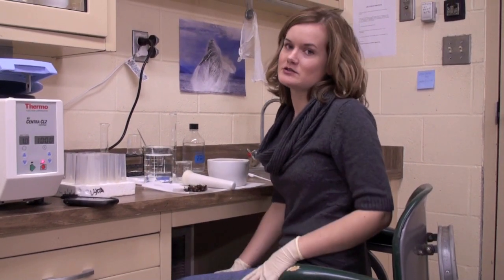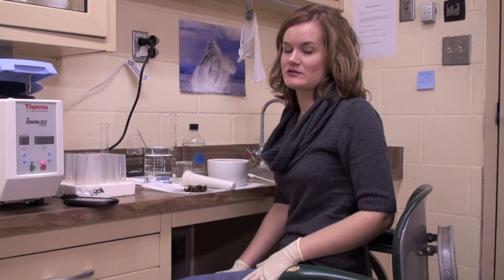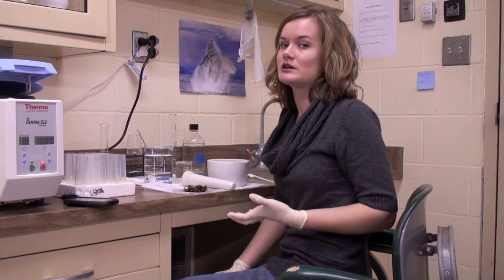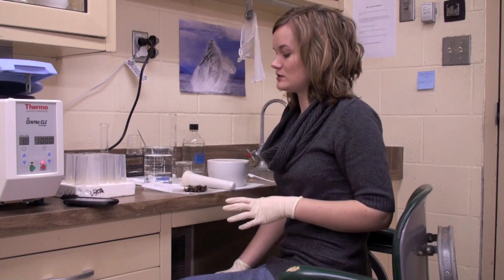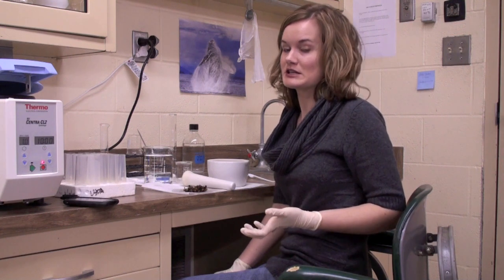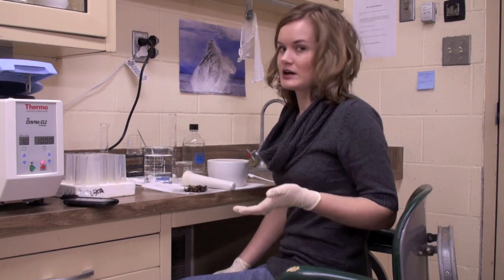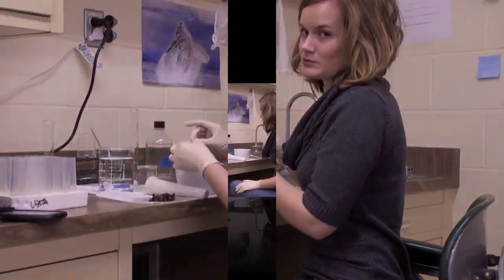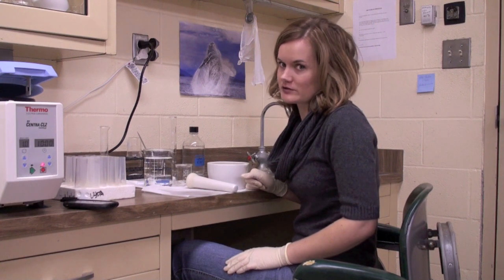Now that we've done our varroa and tracheal test we're going to move on to Nosema. For this test we need 50 bees. As I said in video one, we need half a cup, or more preferably a whole cup of bees, because this Nosema test takes so many bees as well as the varroa. We need to be able to save enough bees when we're done so that we can do another Nosema test if we need to. So as I said, we need 50 abdomens — we're going to pull them off the bee.